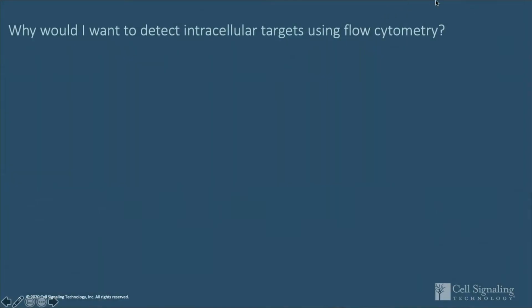So historically, flow cytometry has been known to be very amenable to multiplexing, but largely this has been limited to extracellular readouts. It's really common to use panels of CD markers on mixed cell populations and use that CD marker information to identify the different types of cells that may be present in your sample. You can also break it down by proportion of cells that fall into each subtype.